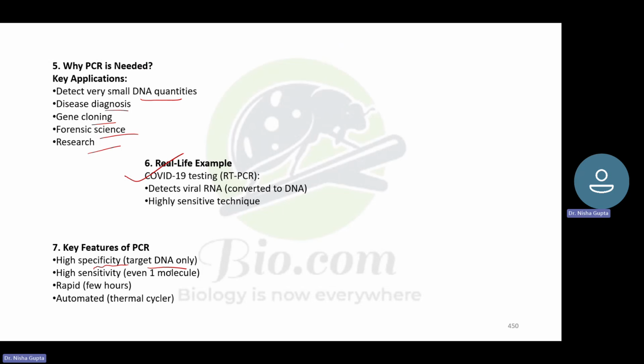Target DNA only को ही amplify कर सकता है, like पूरे stretch, इसमें से आपको सिर्फ इतना stretch चाहिए तो आप उसको भी amplify कर सकते हैं. So it is very sensitive and specific. It is quick, few hours में आपको मिल जाएगा, and it is fully automated. You don't need to do anything.